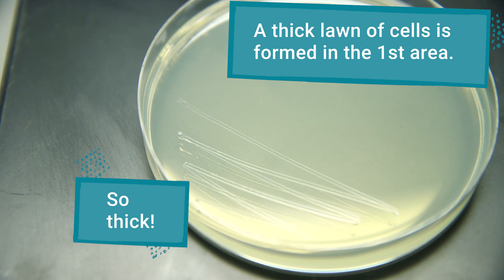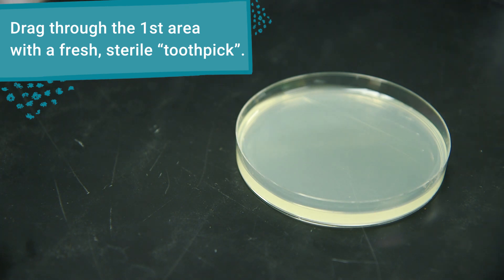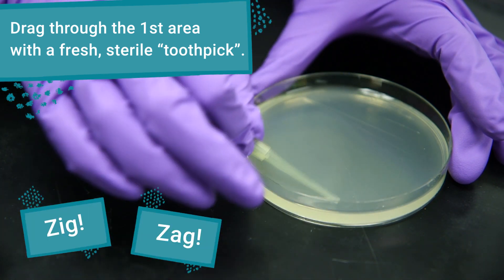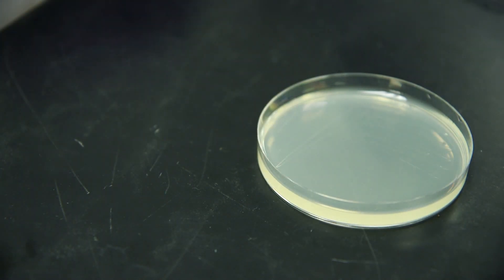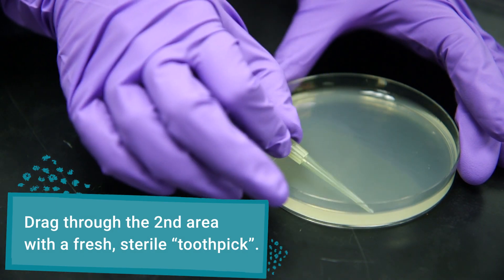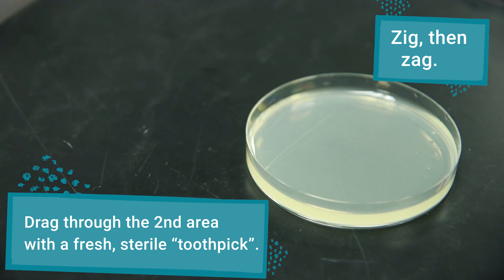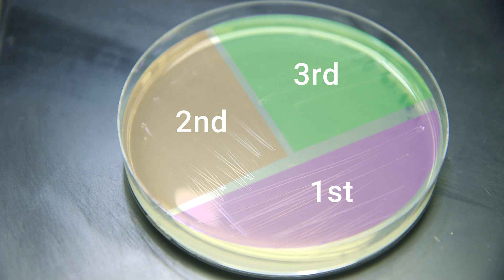To produce individual colonies, grab a fresh sterile toothpick and drag it through the area you just spread cells over. Use that same zigzag motion to spread them out even more. Then grab one last sterile toothpick and repeat the same motion — drag it through the second area and spread the cells in a zigzag motion. This third area will give you the best chance at isolating single colonies.